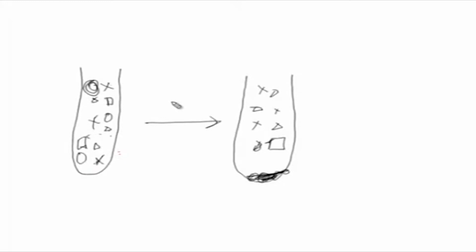So, the larger molecule will travel down here, but the molecules at the bottom will also travel down here, and what you get is a pellet which might contain a major fraction of the larger molecule, but it will also contain other components. This is because they are distributed across, and the one very close to the bottom will also sediment in here. Unless you layer on top, this particular problem will be there.